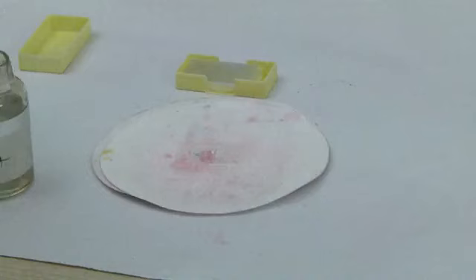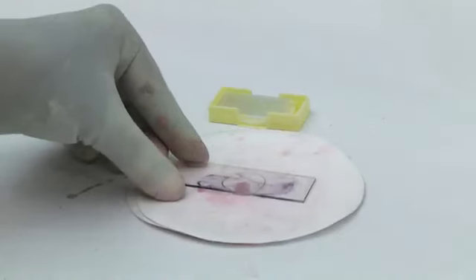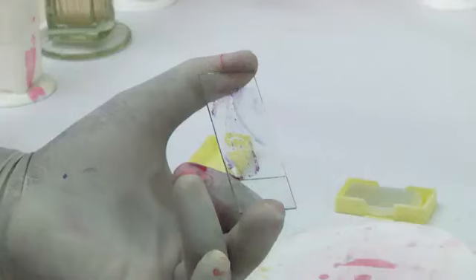If the smear spread is beyond the cover slip area, ideally use another small cover slip or put a drop of DPX and spread evenly with the same cover slip without affecting the focus.